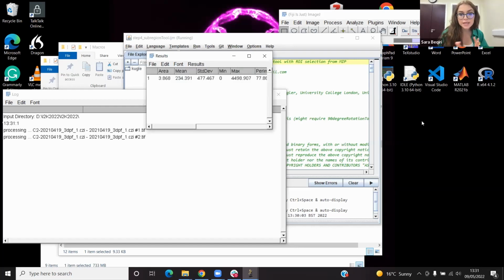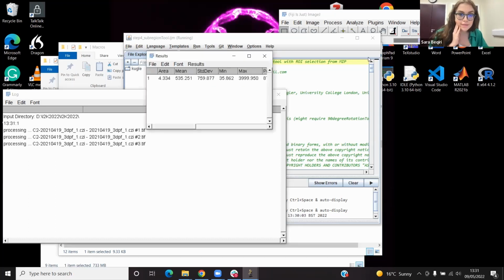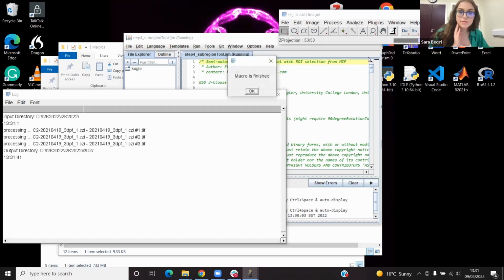So you just have to wait until the macro is done running, and at that point you will get a notification. Yes, macro is finished.